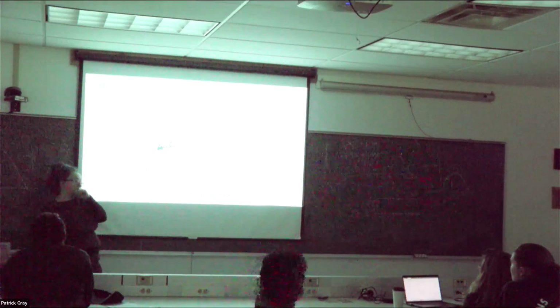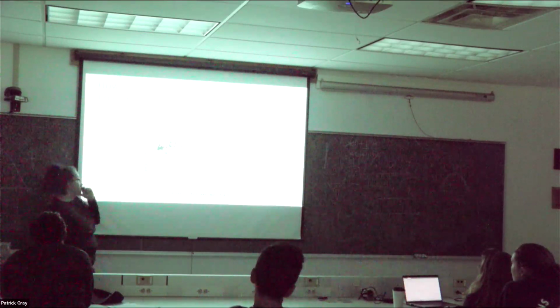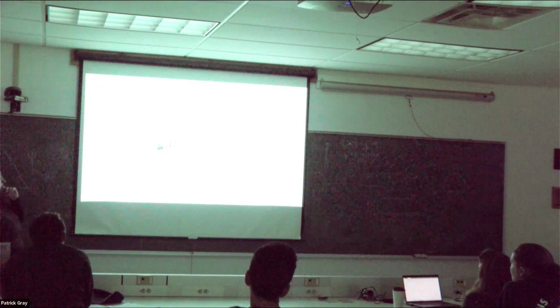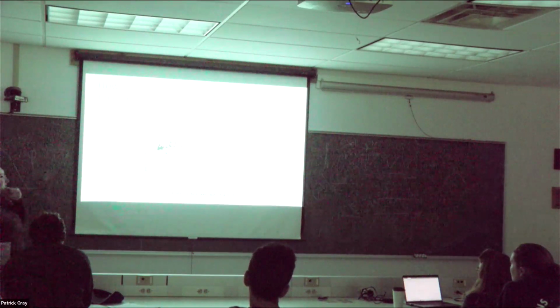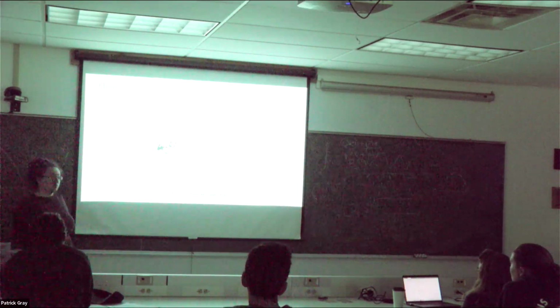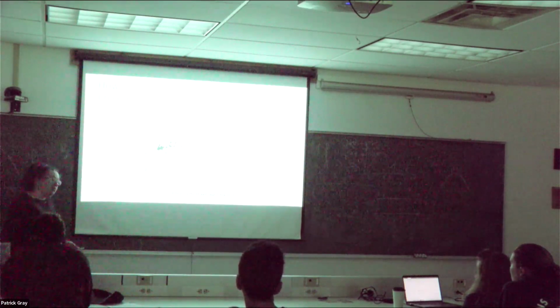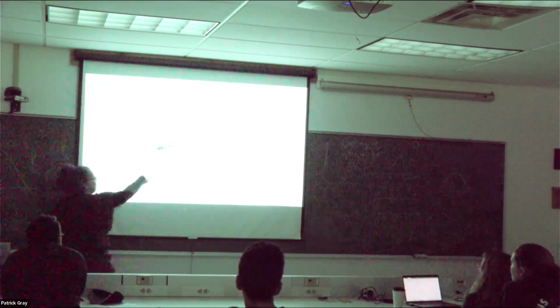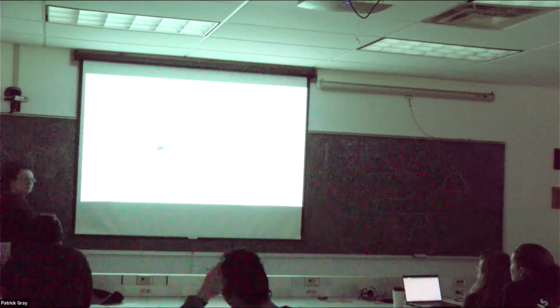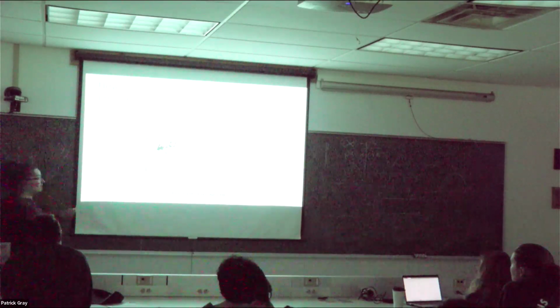In this one, when it's going up, that's saying that the HPLC chlorophyll a is getting higher measurements than the fluorometric chlorophyll a. So it means that HPLC-based chlorophyll, which is our gold standard, is seeing more chlorophyll than fluorometric chlorophyll. And this trend here in gray is saying that HPLC is seeing less chlorophyll than fluorometric chlorophyll.